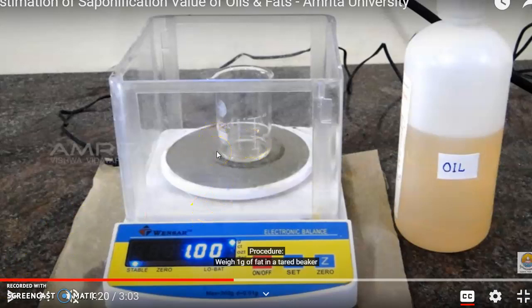Now here we can see the procedure for how to do the saponification value practically. The known amount, meaning 1 gram of the fatty materials, oils or fat, whatever, you can weigh it correctly on your weighing balance.